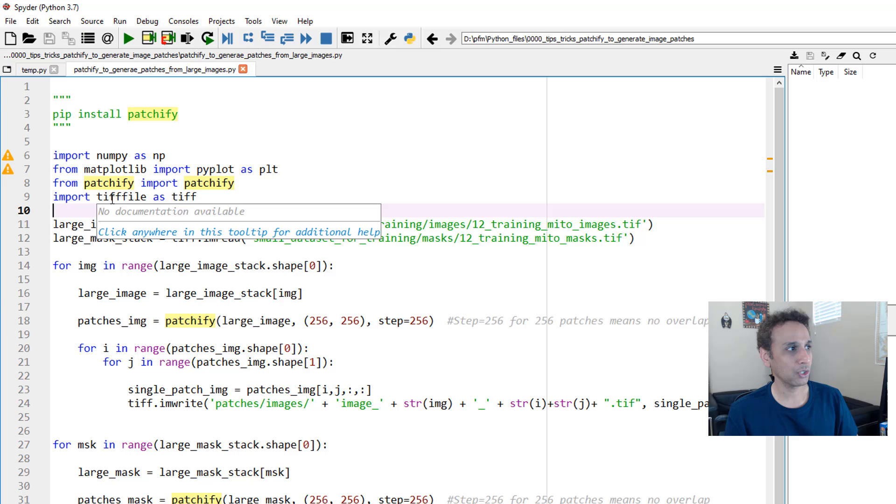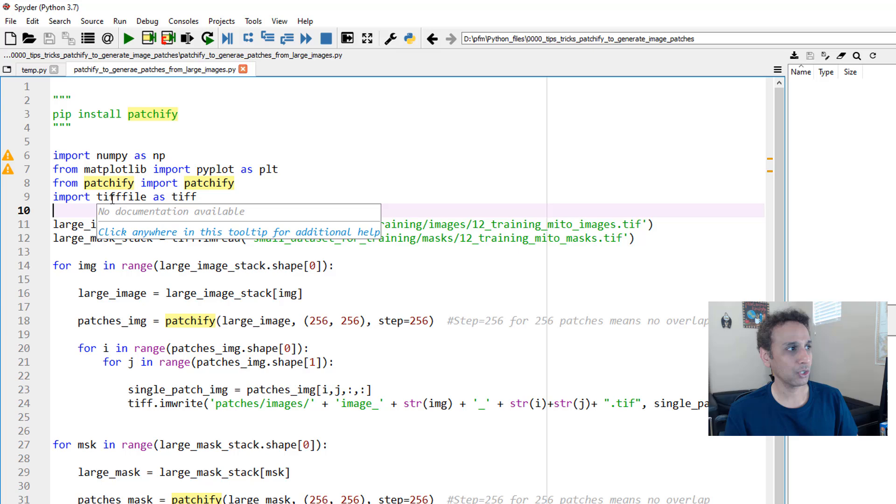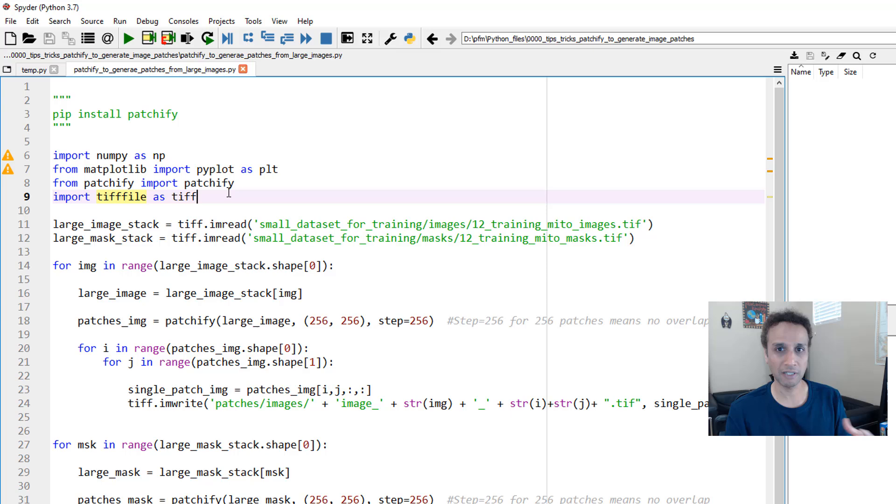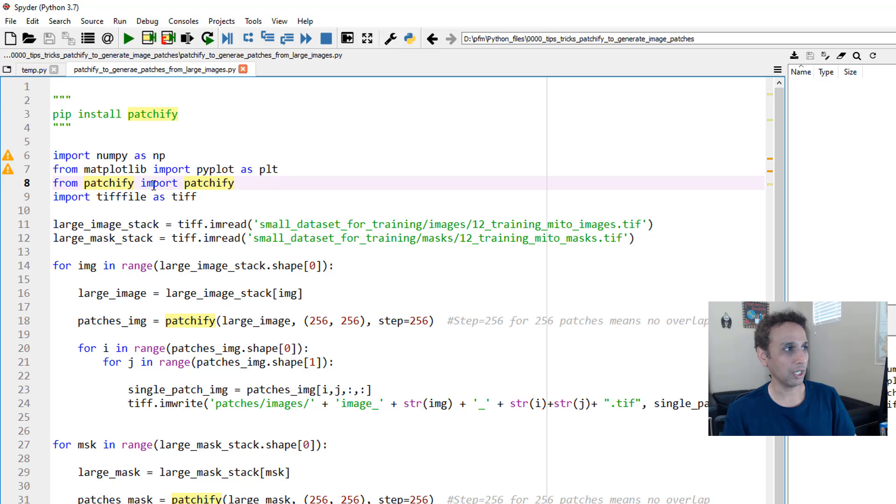It's again pretty simple. Here I'm using—because these are TIF files—I'm using a library called tifffile (T-I-F-F-F-I-L-E) to read these TIF files. You can use OpenCV if they're regular large images or scikit-image. These libraries should be pretty straightforward—there is nothing other than patchify which is what we talked about.